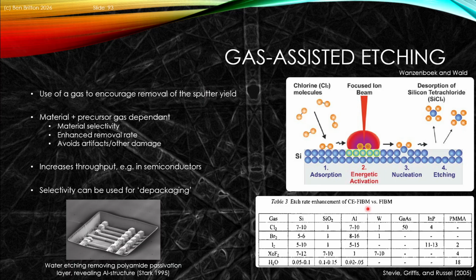So we've talked about deposition. We can also change the gas injection system now to put some different gases, so chlorine in here, etc.